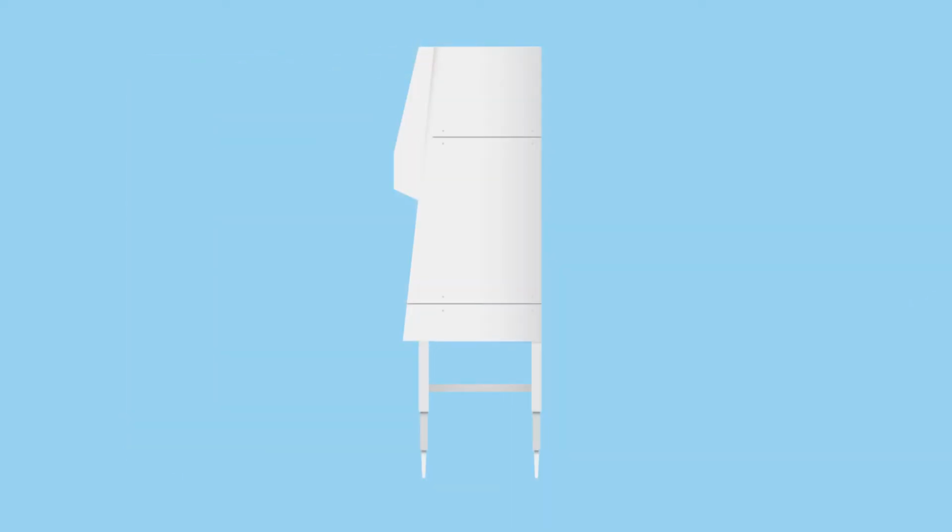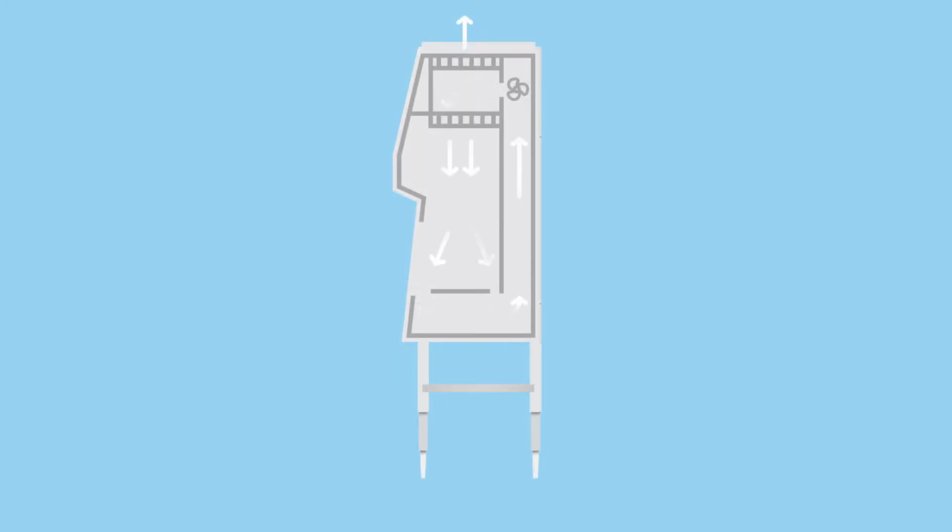The most common type of cabinet found in labs worldwide is the Class II Type A2 BSC. It has a front intake velocity of 100 feet per minute and partial recirculation with approximately 2/3 of the HEPA filtered air returned to the work surface. When you introduce a volatile chemical to the workspace, the recirculated air becomes contaminated. However, it has been previously recommended that minute amounts can be safely used within Class II BSCs when coupled with microbiological work. But what constitutes minute can be left up for interpretation.